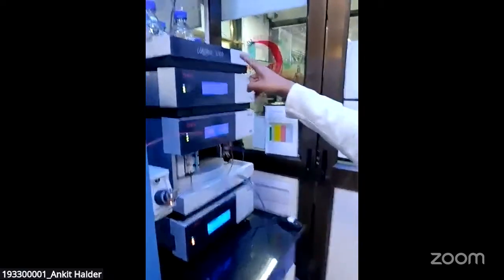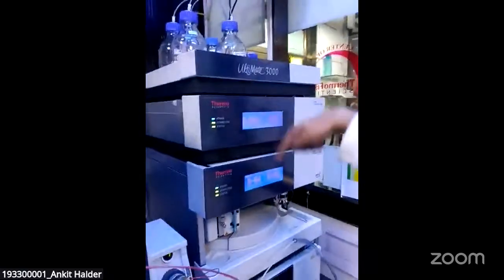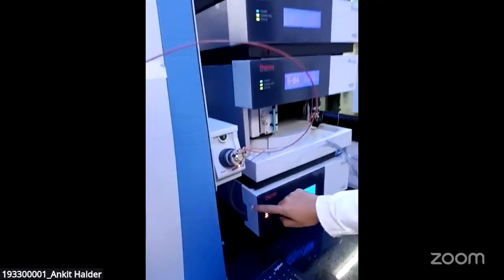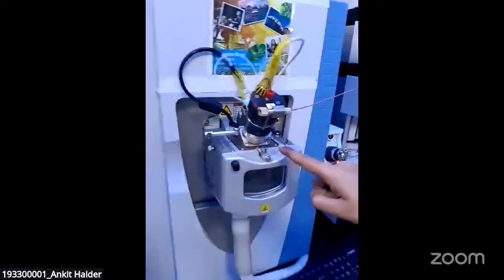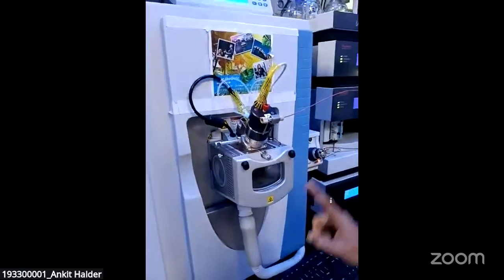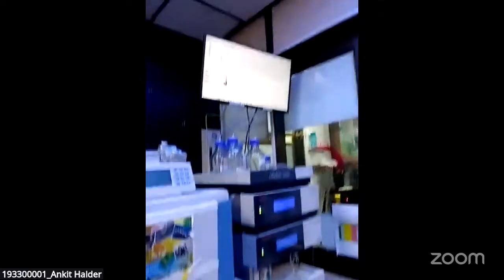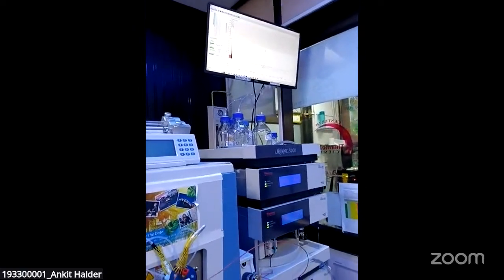Again, just to show you the entire setup once more: this is the HPLC going through the column, where we use reverse phase liquid chromatography, followed by the ionization source, which is electrospray ionization, and then it goes into the analyzer, and we can monitor it. Yeah, this was all for the demonstration of metabolomics.